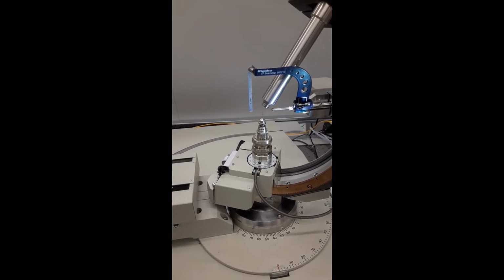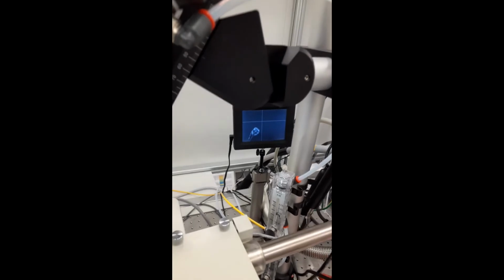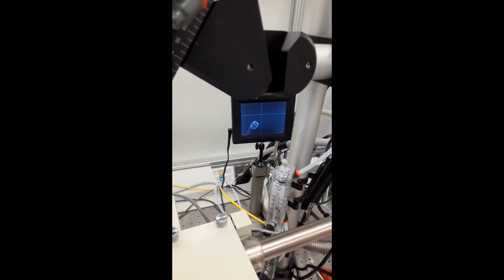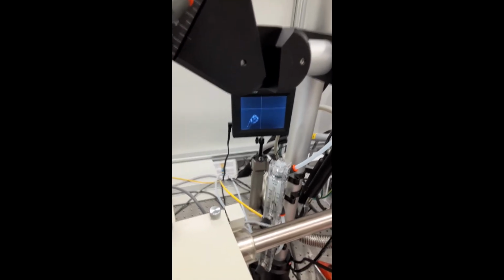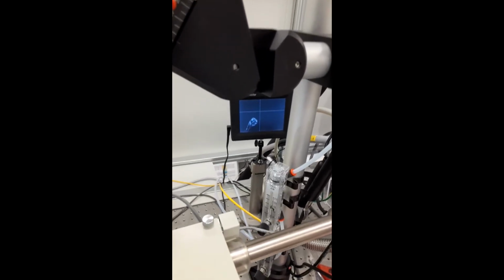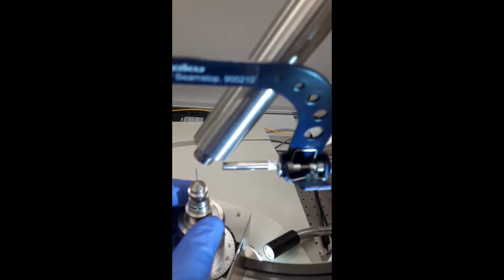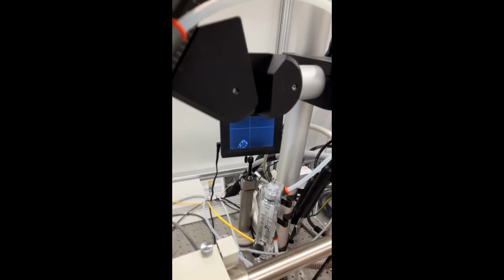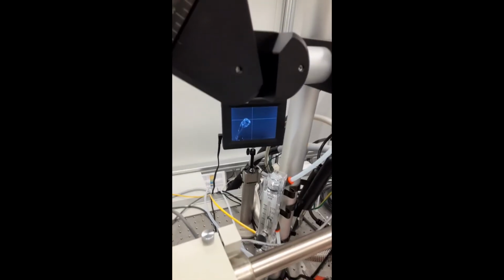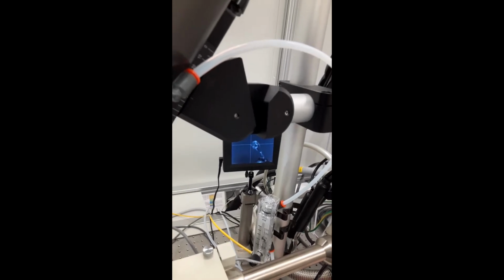Okay, now I have the sample loop mounted on the goniometer with the crystal in it. And if we look at the video display, we can see the loop, the end of the loop, as well as the crystal. The next step will be to center the crystal on the crosshairs. And I know that that is where the beam is because the machine's been calibrated ahead of time. So, using the goniometer, I can adjust the height by spinning this wheel. So we've got the height right. And then if we rotate the goniometer, like so, you can see the crystal move around.